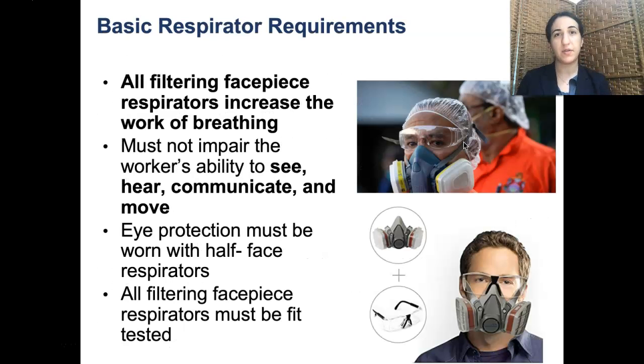As for basic safety requirements, it's important that the respirator does not impair the worker's ability to see, hear, communicate, and move. Eye protection must be worn with half-face respirators. Fit testing is one way to assess these requirements. Fit testing is necessary for all healthcare workers who plan to use a filtering facepiece respirator.